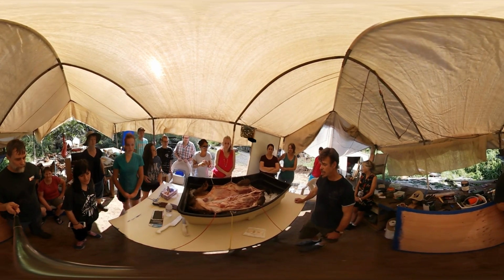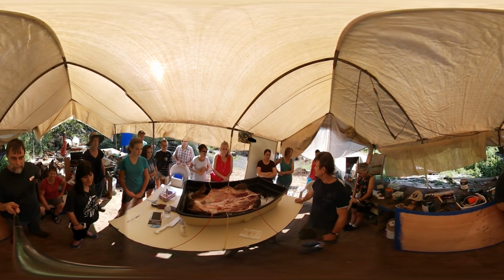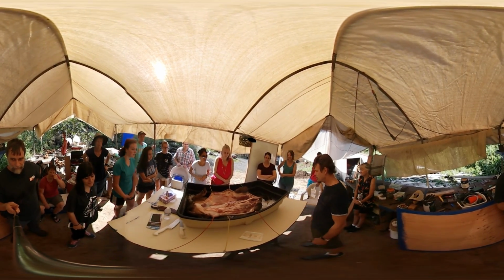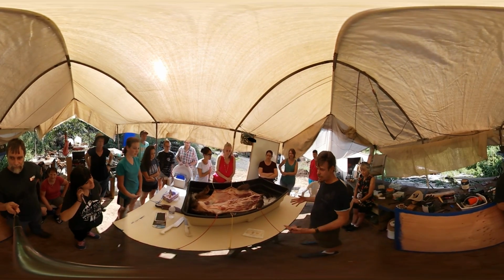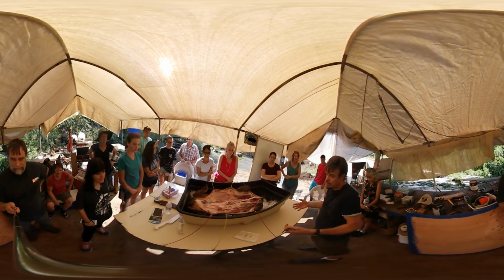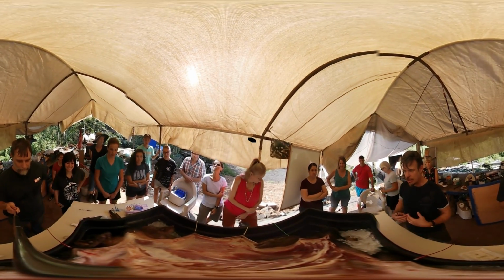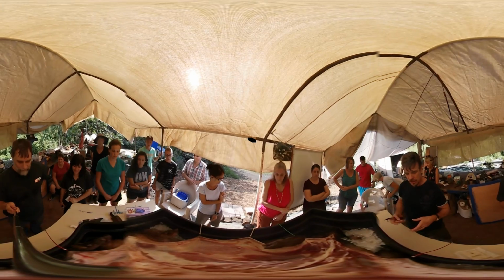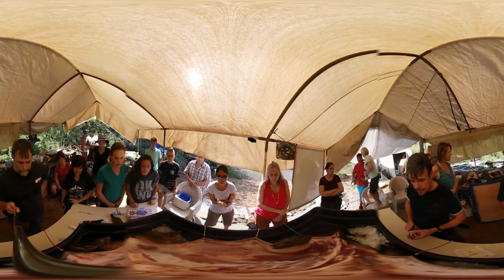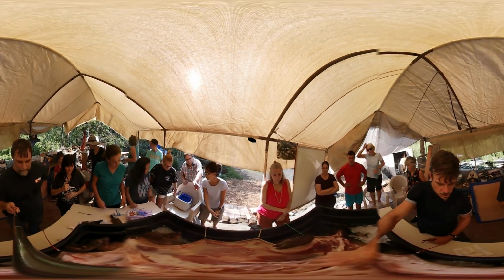So we get to learn something from what's created inside him, which is actually very similar to what's inside of us, humans. The anatomy is extremely compatible, both the same. And so we can learn a lot, and then he is still going to be used for food. So that's where we are. Right now, he's a whole pig, and we've just opened up, and what you can see now is how it looks, the thorax and the abdomen without the skin and the subcutaneous tissues. So this is the sternum here and the rib cage, and then the abdomen.